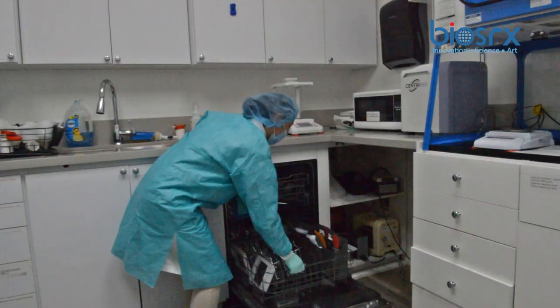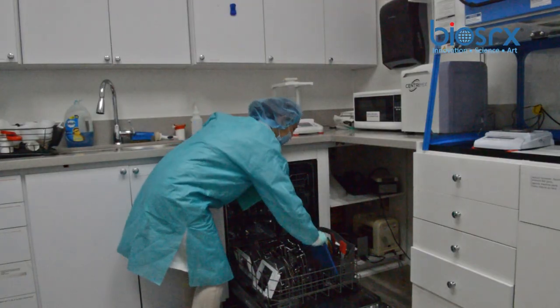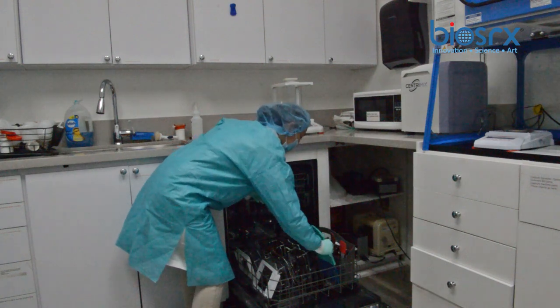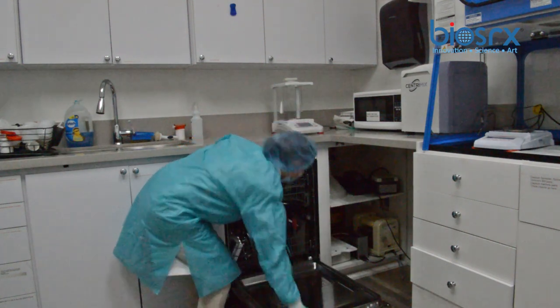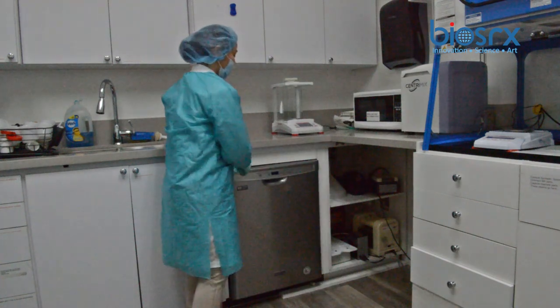After all the trochees are made, the RD trochee molds are dishwasher safe and reusable for the next batch of trochees. These molds can undergo multiple uses and last a long time.